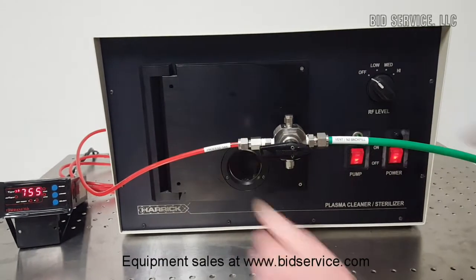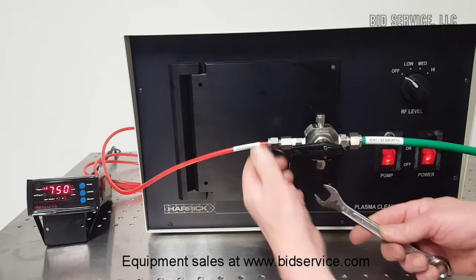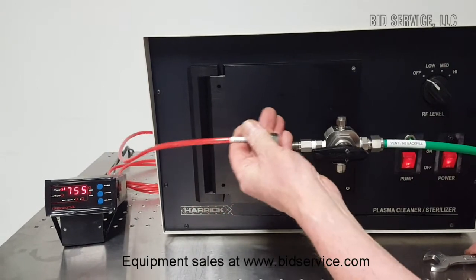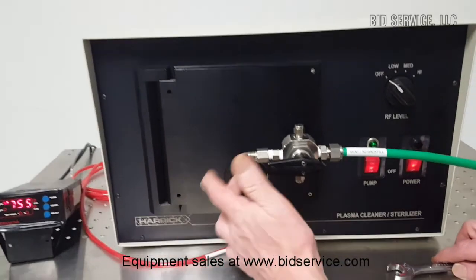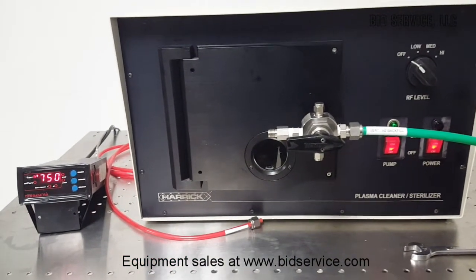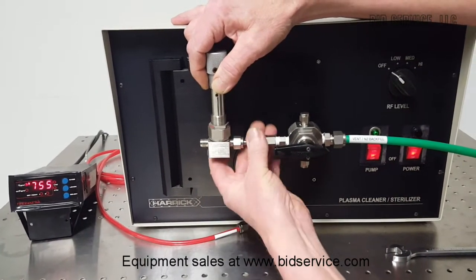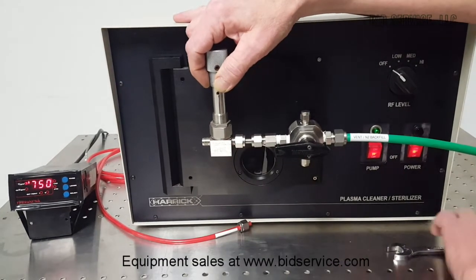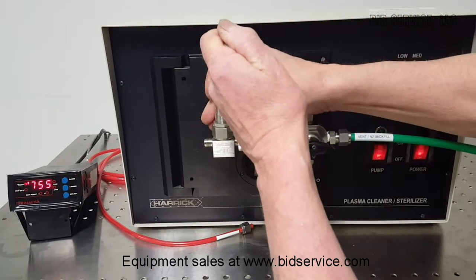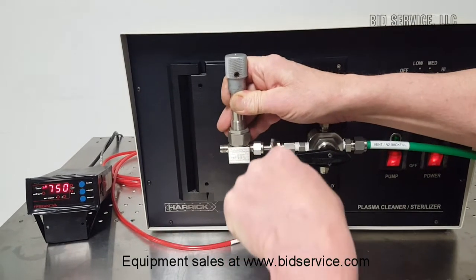In our demonstration here, before you can connect your process gas directly to the chamber, you have to supply — this is supplied by the customer — a special needle valve. These are easily obtained. What this needle valve does is allow you to throttle in the amount of gas that you think you are going to need.